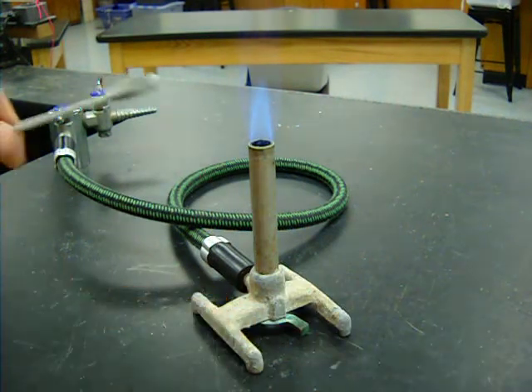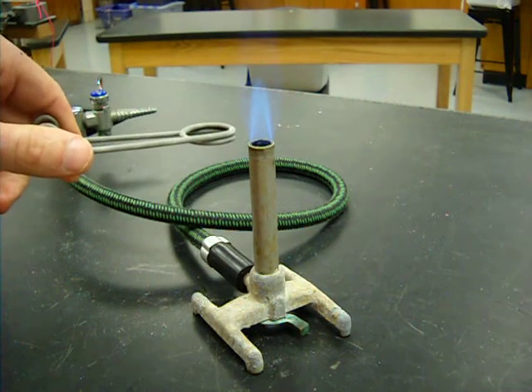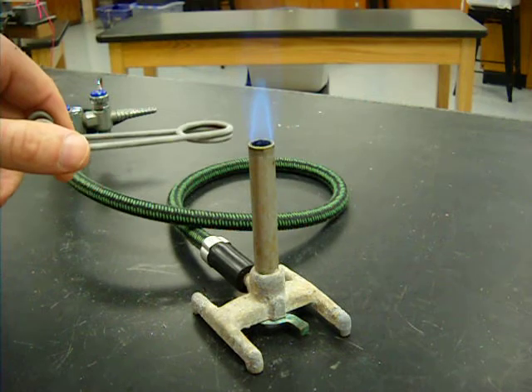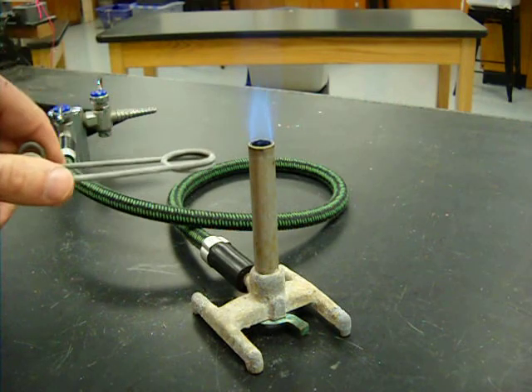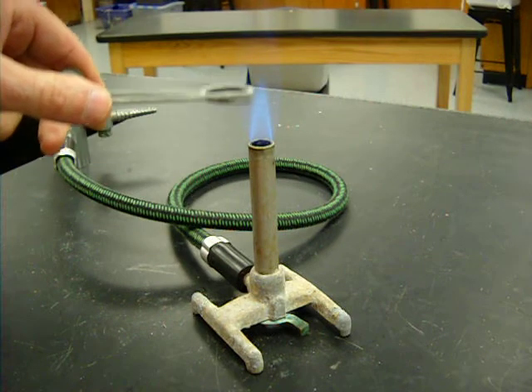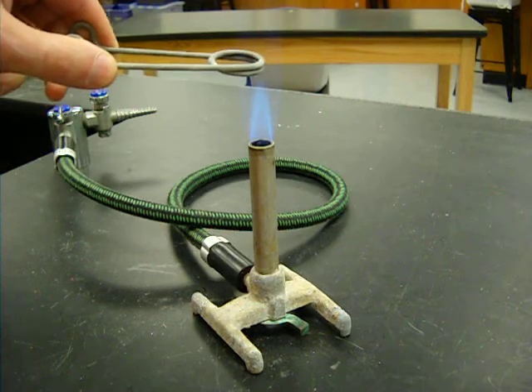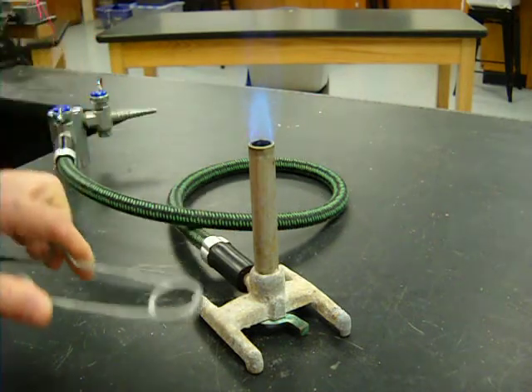You'll notice that there is this bright, light blue cone in the middle of the flame. That's the hot part. Inside that cone, there's just raw gas and air. There's no burning there. The burning is happening at the margins of the cone. And the hottest spot is right here at the very tip of that light blue cone.